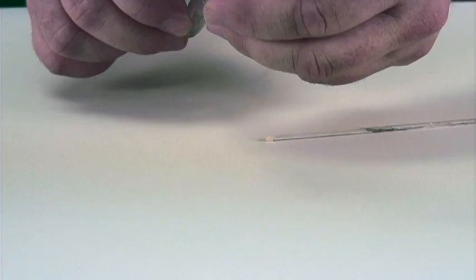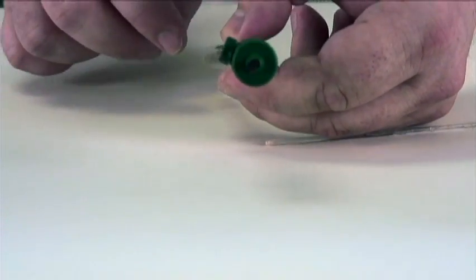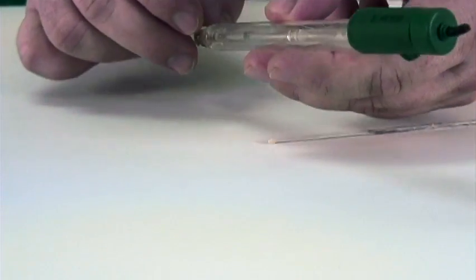In the single junction electrode there is one barrier between the reference wire and the solution being measured and that's the reference junction.